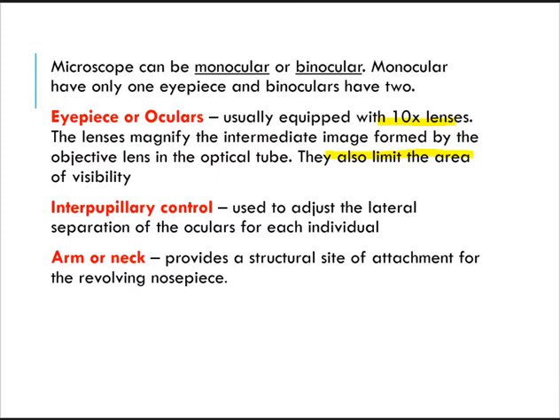The user or the medtech should focus both eyes, because what we usually use in the lab are binoculars. So we should focus both eyes comfortably, and we must see one clear image only.